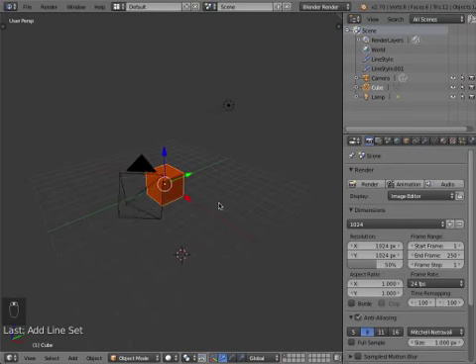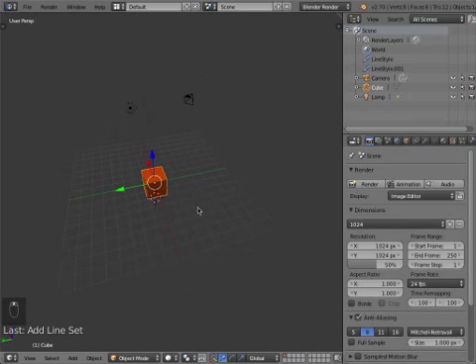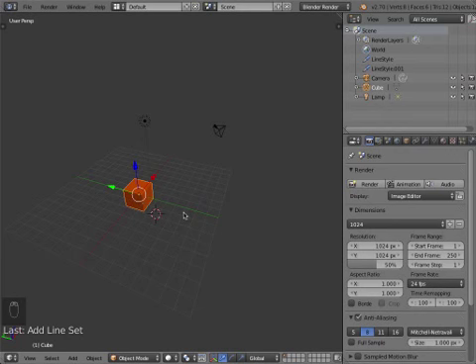What did I do? How did you make the hidden lines dotted? Don't worry about that. We want to go and have a look at the atom probe stuff. This is just the basics. You can go back into the recording and have a look at that.